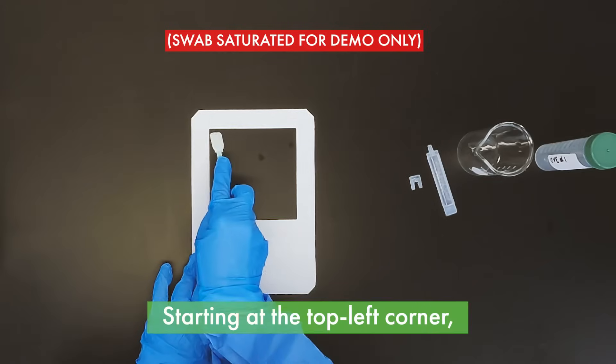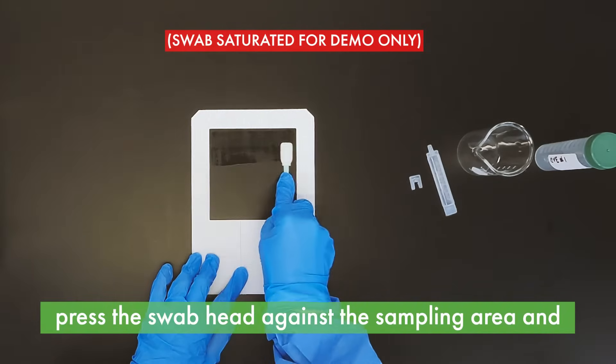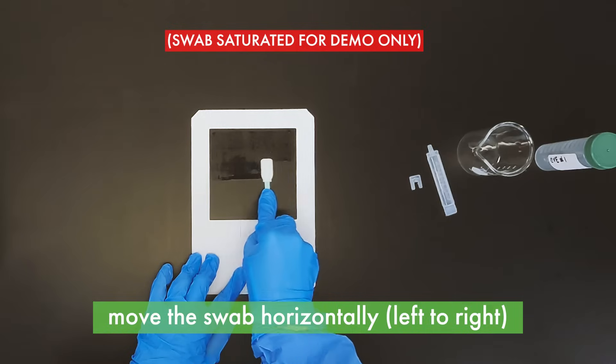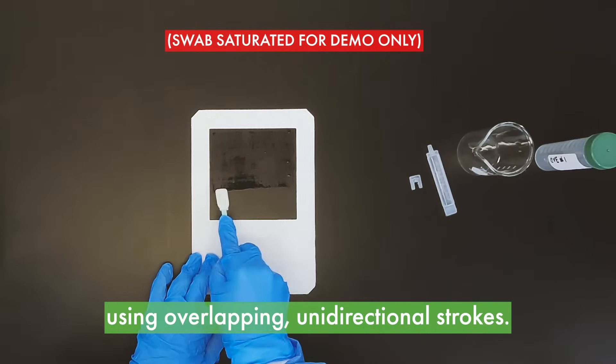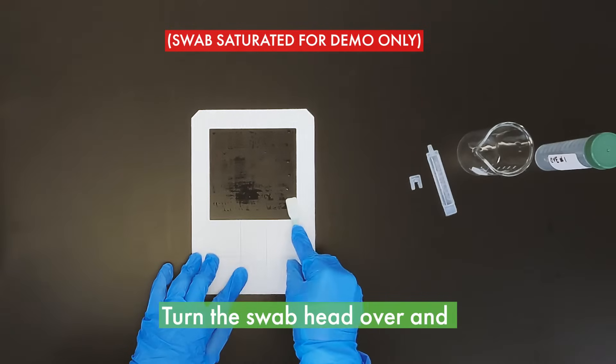Starting at the top left corner, press one side of the swab head against the sampling surface. Move the swab head horizontally left to right using overlapping unidirectional strokes across the entire sampling surface area.